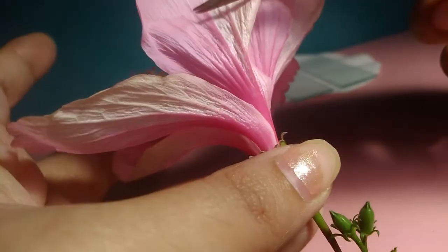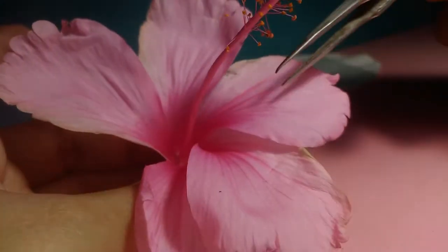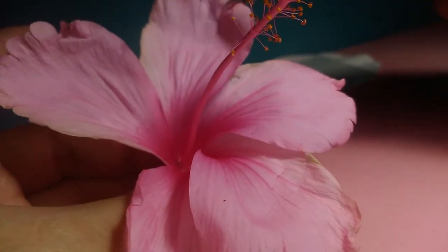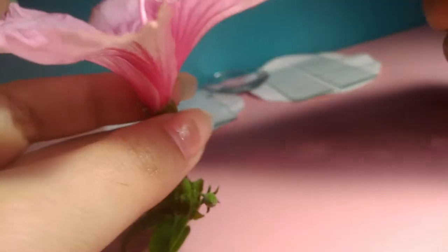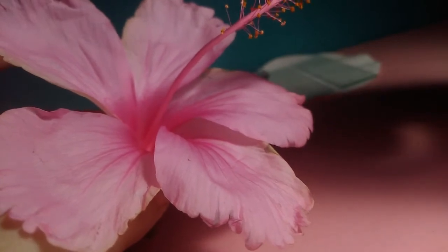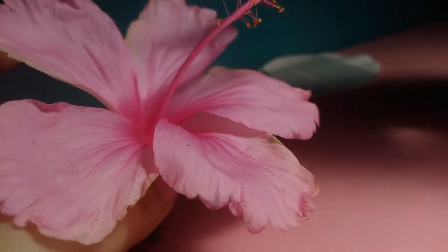Then we have our corolla. This structure is known as the corolla. This is the second whorl of the flower. This is the corolla, and each unit of corolla is known as the petals. Then we saw our stamens. These yellow dots on the stamens are actually the anthers, and the stalk holding the anthers is the filament.